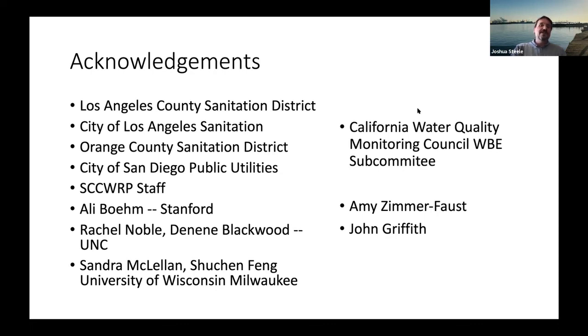When you're integrating it over a fairly large sewage area, it does seem to relate really well to cases. In smaller areas, some folks have been doing really good research on university campuses where they have dorms and can test the entire dorm and measure the wastewater coming out. They've also found really tight correlations.